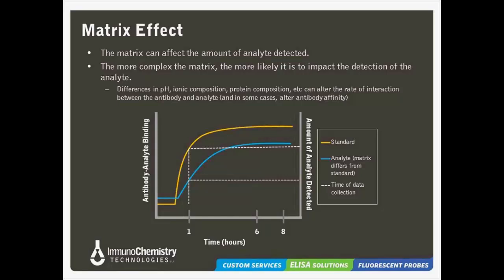Typically none of these ELISAs are run to equilibrium. You don't have enough time. It's not worth it. We try to capture a signal at a point where it's starting to flatten out. And so ELISA is not endpoint. It's not total equilibration. It's getting to a point where it's not changing too fast so you can get an accurate reading.